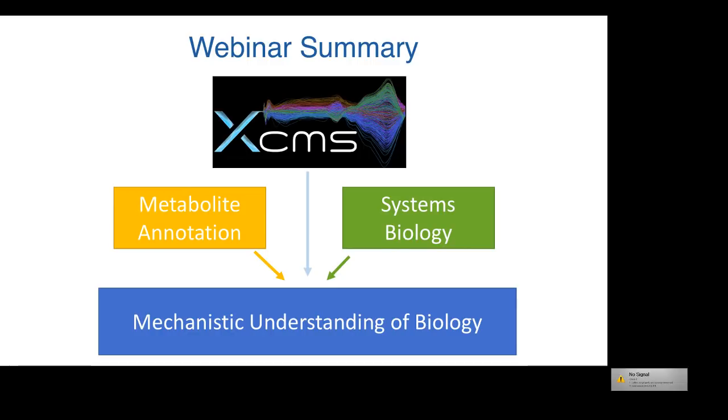However, what our systems biology algorithm does to assign the putative identification is it actually uses the pathway data that's predicted from the genome of the organism as a piece of orthogonal data in addition to the mass and other mass spectrometry based data to give that putative assignment. But you do need to do formal identification on that feature to confirm it.